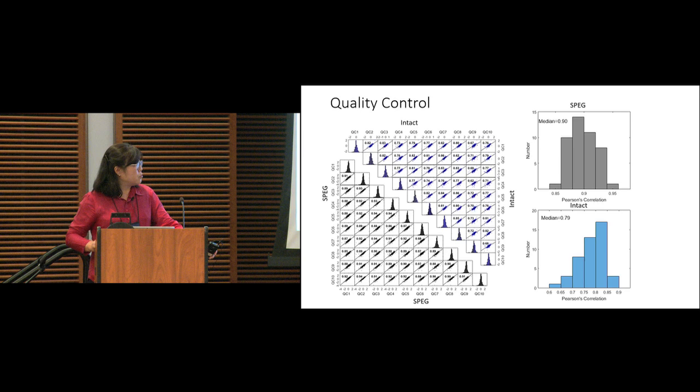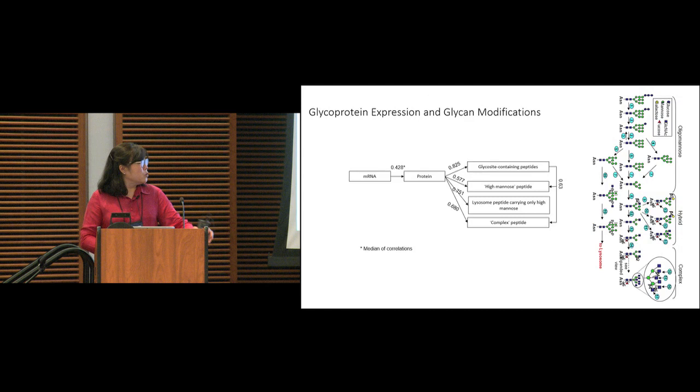So this is basically the entire sample labeled by TMT before we do any glyco enrichment or glycoside enrichment. The quantification also comes down to quantification accuracy when the glycopeptide is quantified with TMT, since sometimes the glycan can easily break down compared to the TMT reporter. So the intact glycopeptide generally had slightly lower reproducibility due to the fragile nature of the glycan. Due to time, I'll summarize what we observed from this analysis.